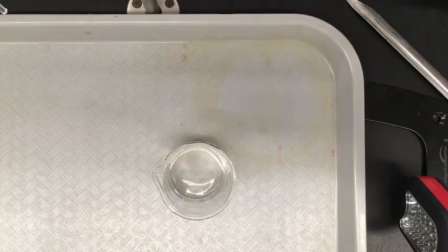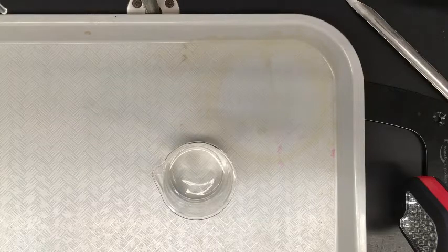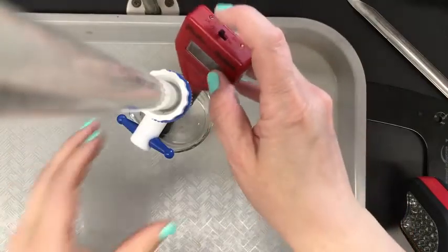I have added some phenolphthalein just to have that indication as well, but we'll be relying on our pH meter for this titration. We'll take regular measurements and record that information down, and we'll be able to plot our titration curve of pH versus the volume added. So I'll be making additions and doing readings along the way.